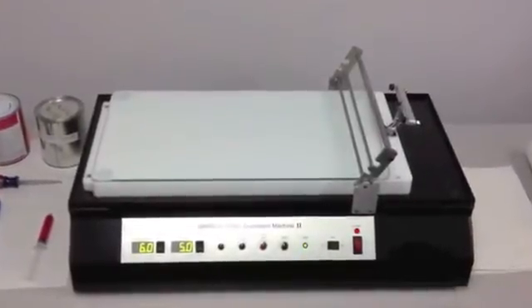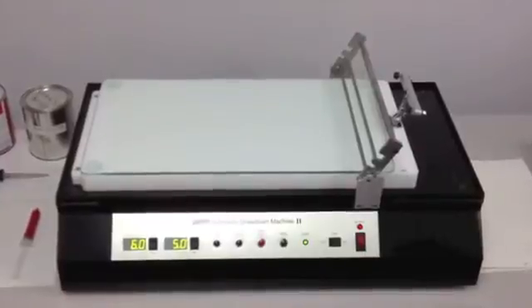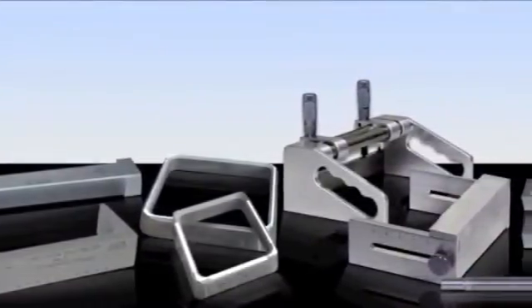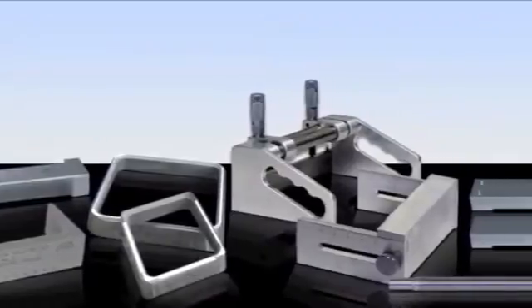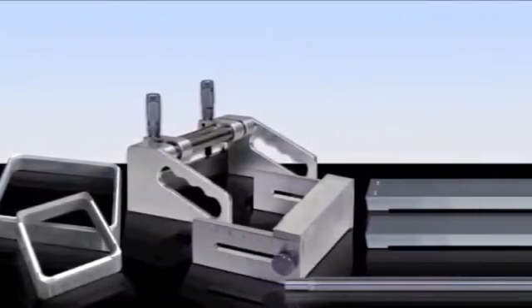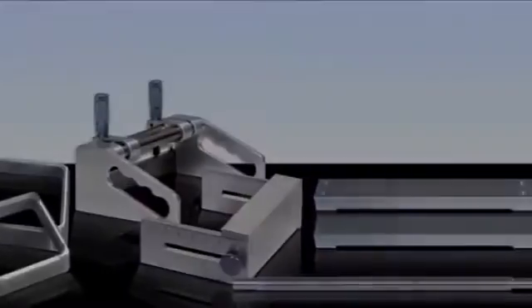Today we will be demonstrating how to use the GARDCO automatic drawdown machine. Many types of applicators can be used, such as the SAG index, the 2 and 8 path, the Microm 2, the Universal blade, and the bird type, as well as wire wound rods.